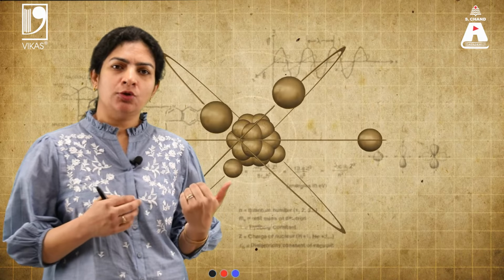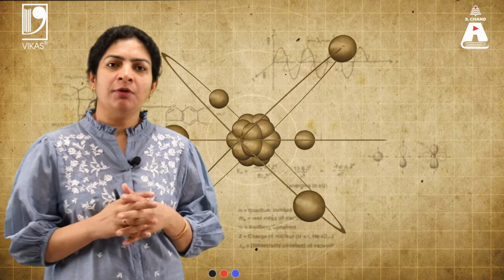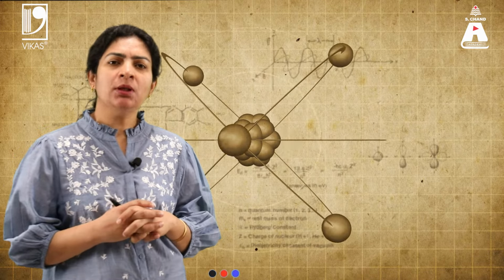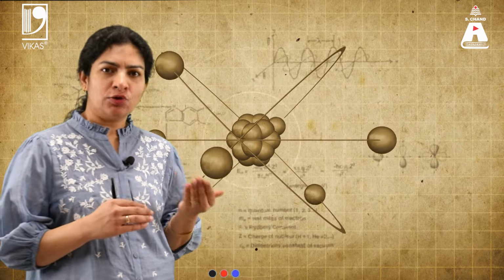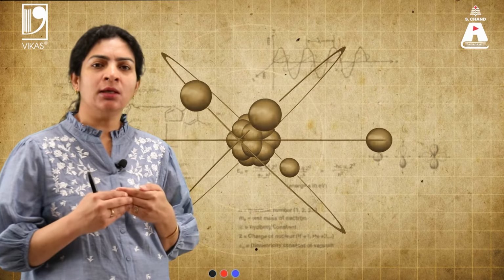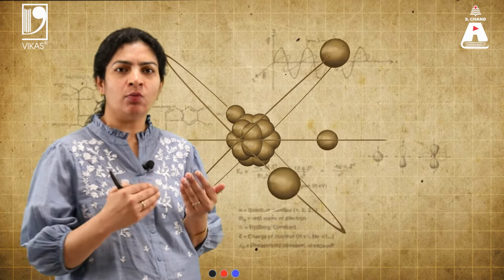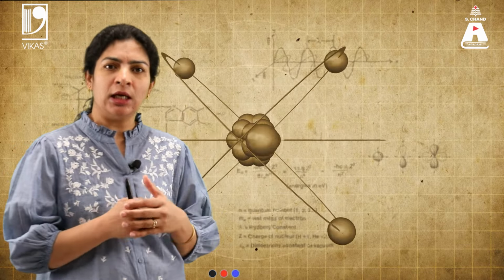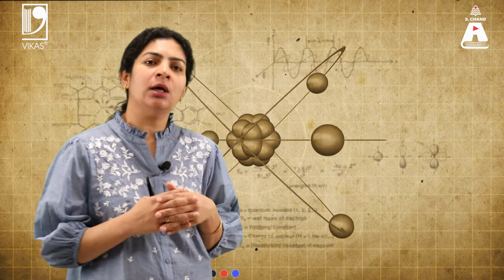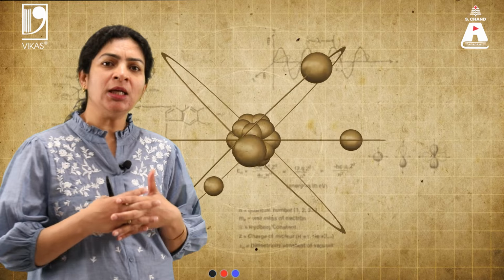In the previous part of the topic NMR spectroscopy, we have understood the basic principle and the instrumentation involved in NMR spectroscopy. In part 2 of this lecture series, we are going to understand what chemical shift is and how the chemical environment of a nucleus affects the magnetic field at which it is absorbed. We will also cover the applications of NMR spectroscopy in this lecture.